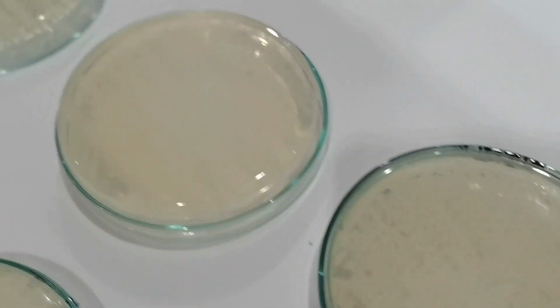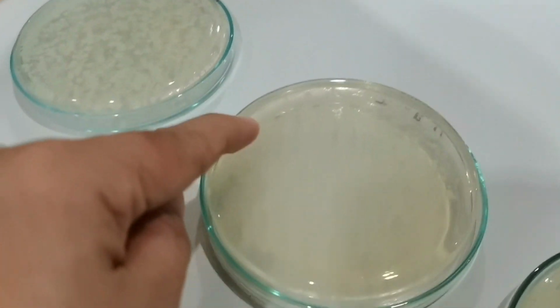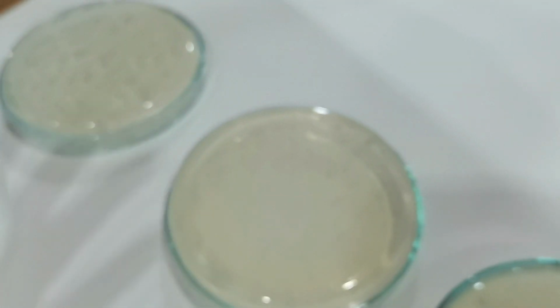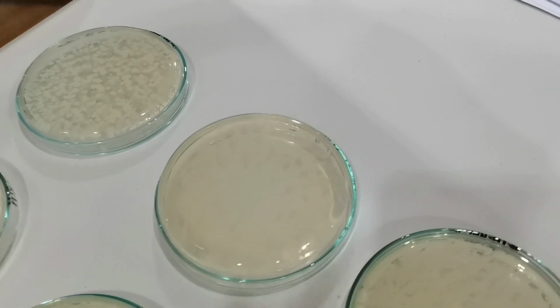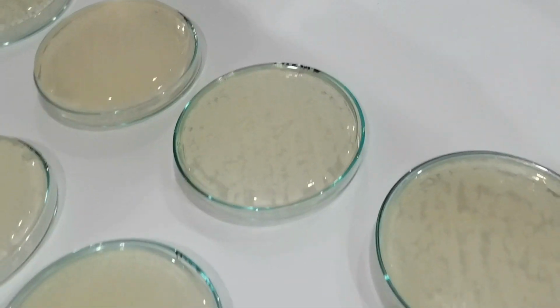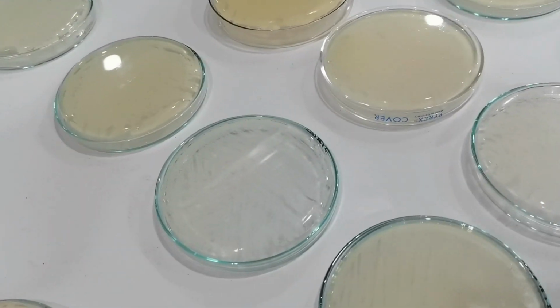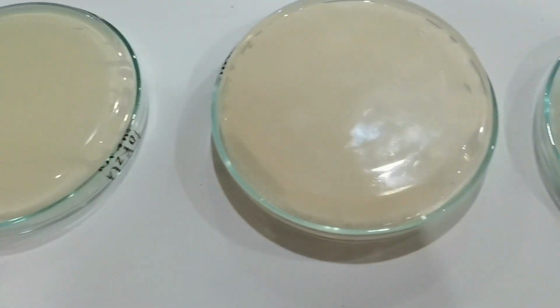So that's a colony type, meaning maybe the cells on those empty parts were affected by UV, and therefore they were not able to grow. So maybe a lethal effect at this point. Probably there is also some in the others, but not too obvious. You can see at 0, it's a nice lawn.